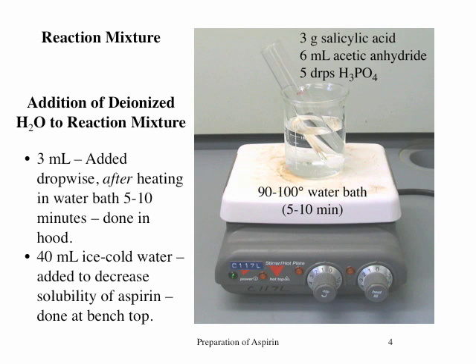A beaker containing several hundred ml of water is placed on a hot plate, and the hot plate turned on until the water comes to a near boil. The test tube containing the reaction mixture of salicylic acid, acetic anhydride, and phosphoric acid is then heated in this water bath for 5 to 10 minutes. During this time, all of the salicylic acid should dissolve. If it doesn't, it should remain in the hot bath until it does.